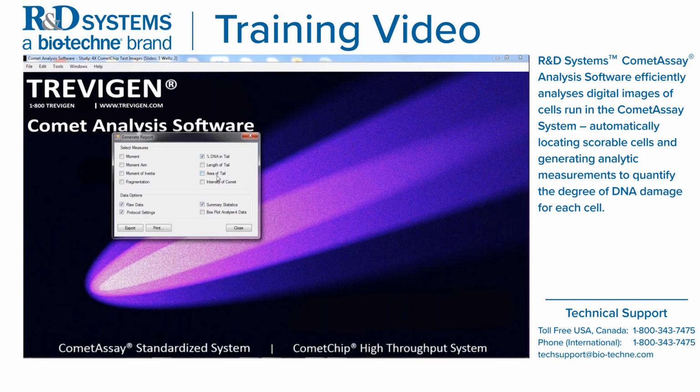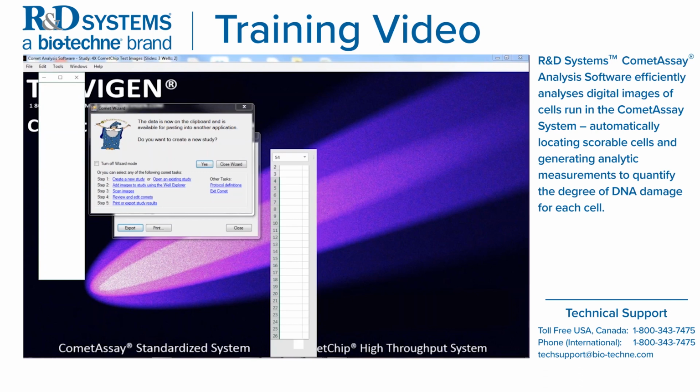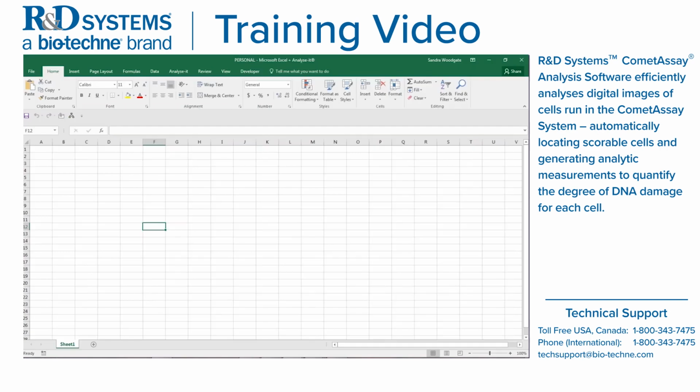So you've selected all this. You can print it, but probably most people are simply going to want to export this data to Excel. So let's hit export. It says the data is now on the clipboard and is available for pasting into another application. It's also asking if you want to start a new study. But for right now, we need to paste our data into Excel. So open up Excel. Okay, and we are going to paste our data.